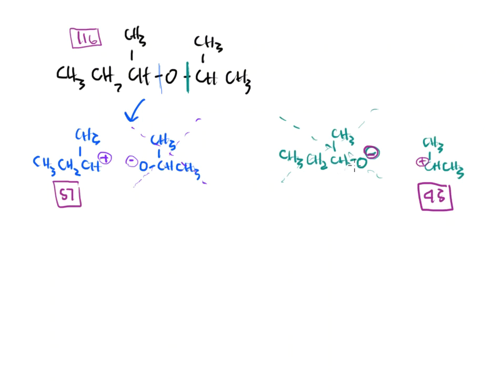If I look at option number 2, the oxygen went away with these 4 carbons. So it looks like this might be a more stable fragment, meaning that if this is the more stable fragment, then this is probably going to be more abundant when it cleaves in reference to the other option. Now, is that going to be true? We'll take a look at this when we take a look at the mass spectra.